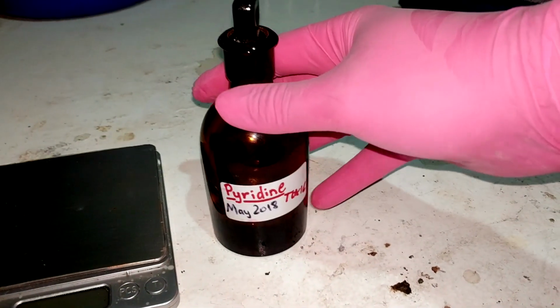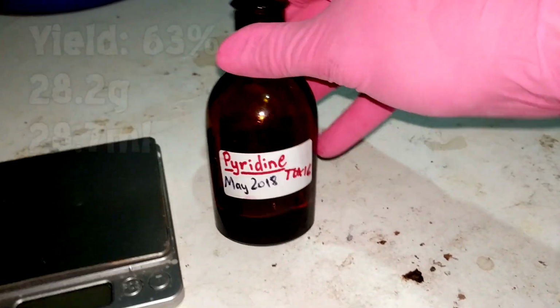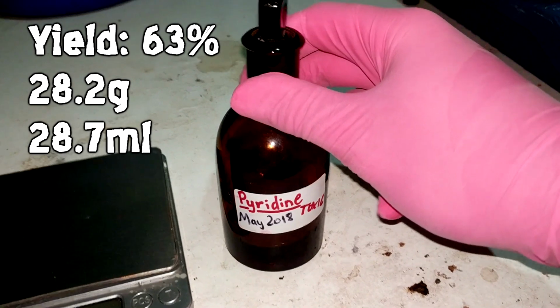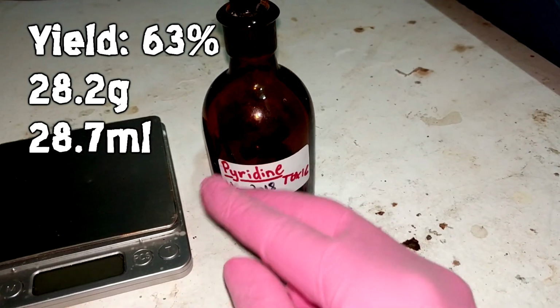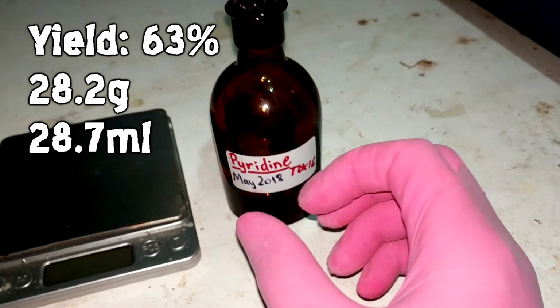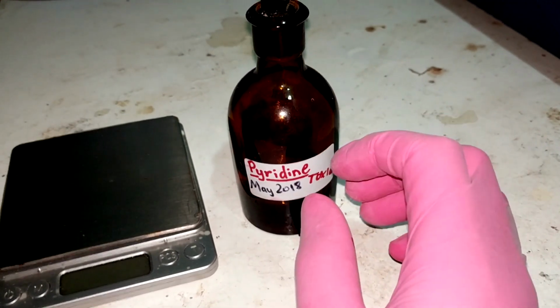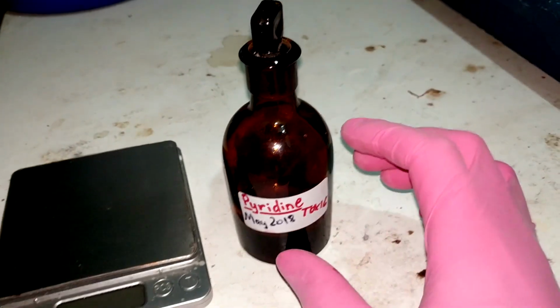Alright, and here's our final yield. 28.2 grams represents a percentage yield of 63% based on the 70 grams of niacin we put in there. If you remember at the start of the video, we discussed how if we used basic copper carbonate, we'd get a yield between 40 and 50. But if we used our high-tech copper chromite catalyst, we should be getting yields in the mid-90s, I guess. Well, we got neither of them.